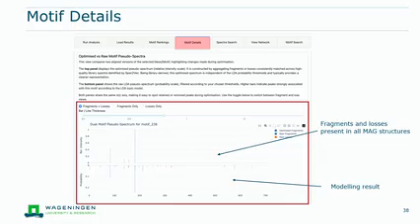I mean, if you, for example, want to check for the substructure in your data set, then you have the chance to use 4 fragments which are a good indication that this structure is really present. Because some substructures can also be identified by only 1 fragment if it's a small substructure, but this is obviously not as distinctive as if you have 4, for example. It can also happen that there are no fragments. It simply means that the annotation and the spectra behind the structures are just not aligning. Again, it can be an indication that you have to deal with novel compounds, so you have to investigate it yourself, or that the master motif is not representing anything in particular really well.